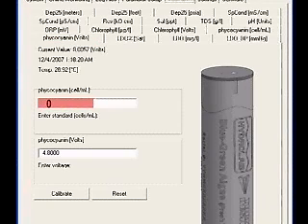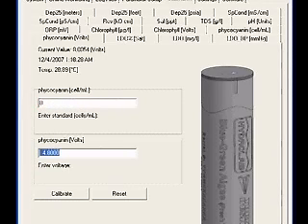Type zero into the box labeled Phycocyanin cells per milliliter or Phycoerythrin cells per milliliter. Type the voltage from the original zero-point calibration in the box labeled Phycocyanin volts or Phycoerythrin volts.